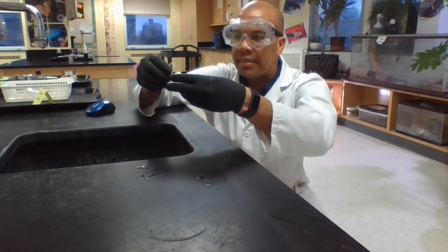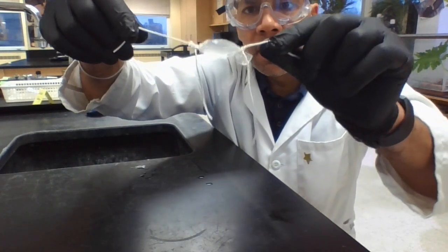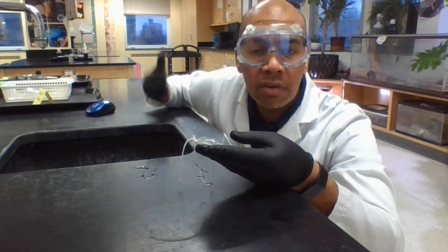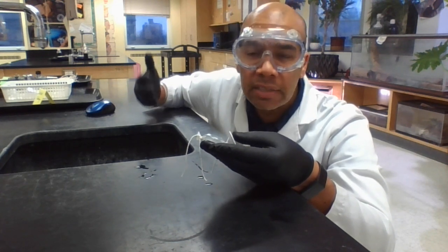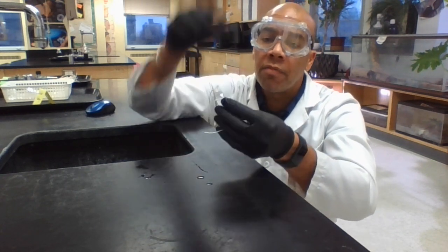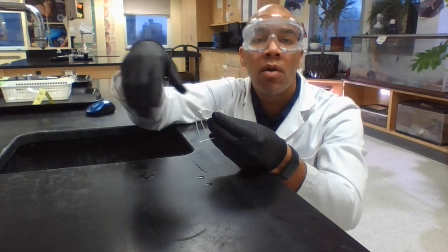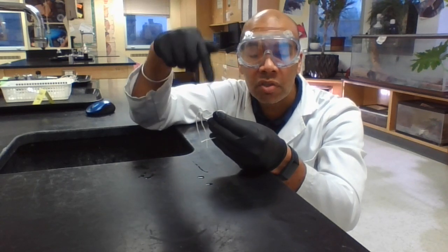Aha! I did it! All right, so now I have what looks like a piece of candy, all right? But this is representing our small intestine layer, our skin layer of small intestine. There's also a muscle layer, all this different kind of tissue that makes up the lining of the small intestine. And we have food inside. We have starch and we have glucose, okay? So it's as if you just ate a graham cracker, or in this case, McKenna ate a graham cracker, and inside of her small intestine is starch and glucose.